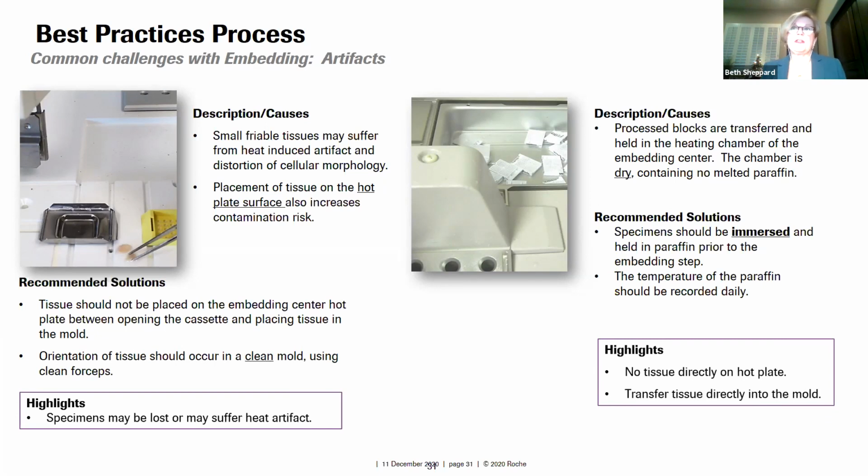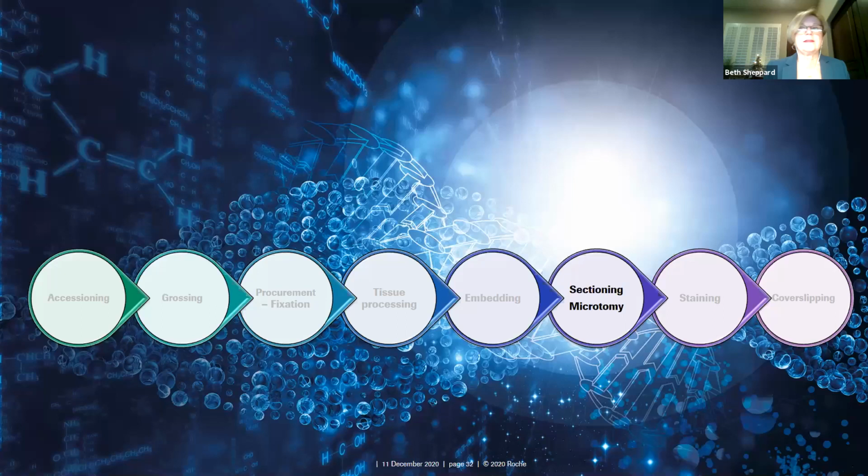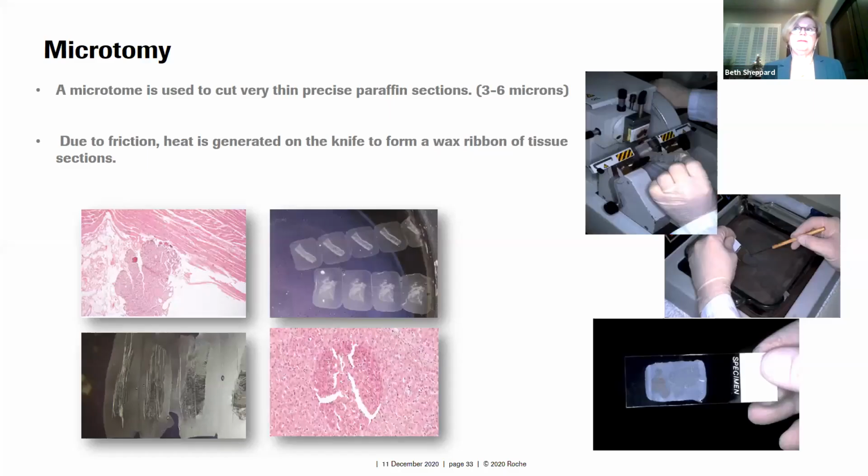And of course, be very careful when you're opening up those cassettes. I've spent many times opening up the cassette and those tiny biopsies. What you don't want is to flip it off, and it's just a nightmare if that should happen.